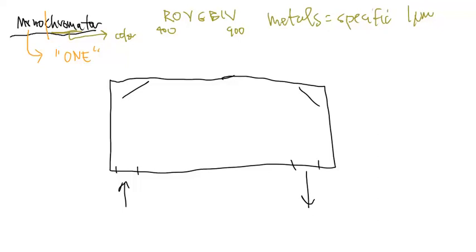The light beam will come in and hit one of these mirrors, which will then reflect it onto a very special piece that we'll talk about in just a second. That piece will then do something to the light, and then it will reflect it to another mirror that delivers it outside of the monochromator box. So the monochromator's job is to pick one wavelength at a time, one color in a way.